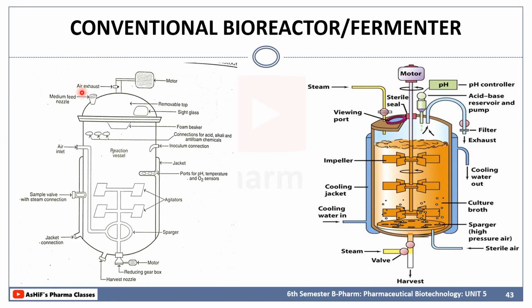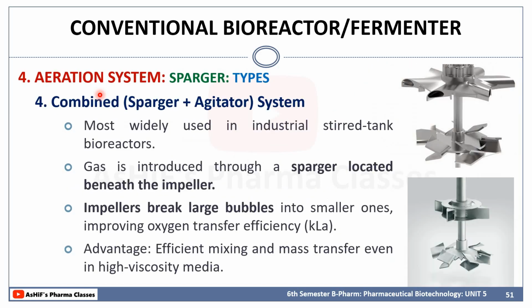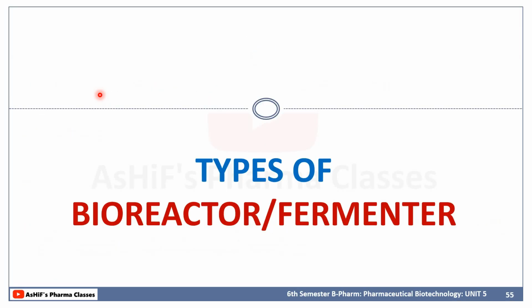Depending on the marks and the question, you have to elaborate on the different parts of the fermenter in detail. So this is all about the design of a conventional fermenter. This is a frequently asked question also, so be very thorough with this topic.